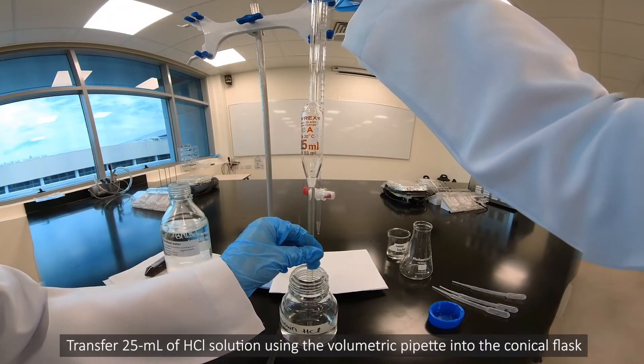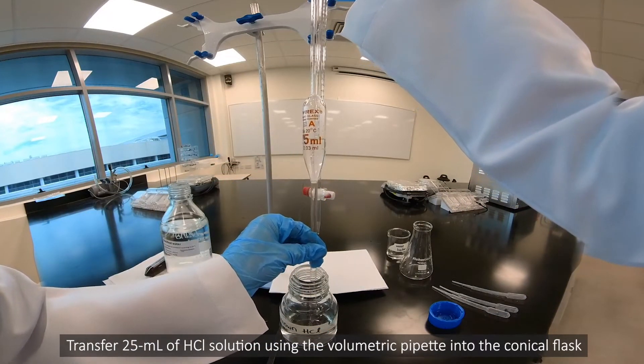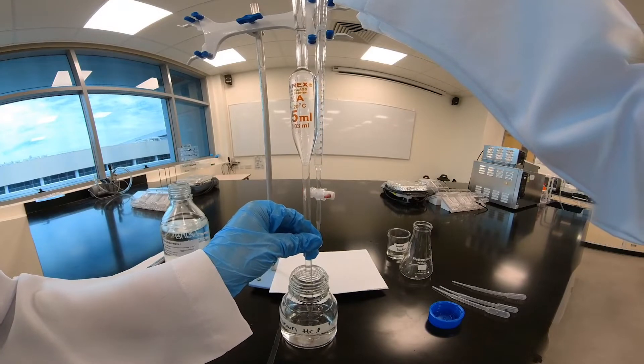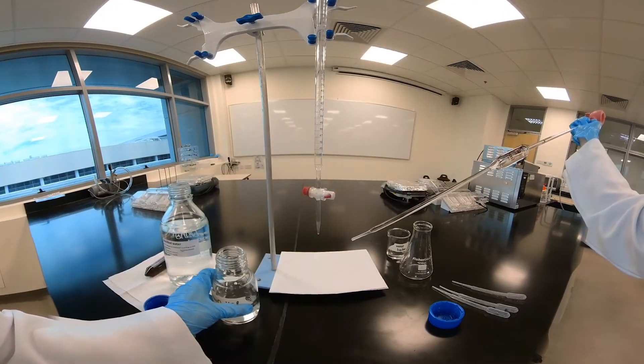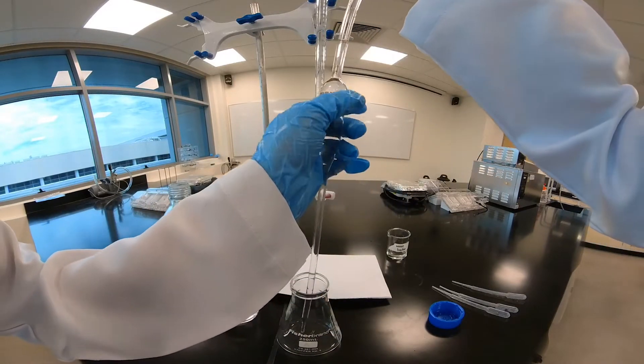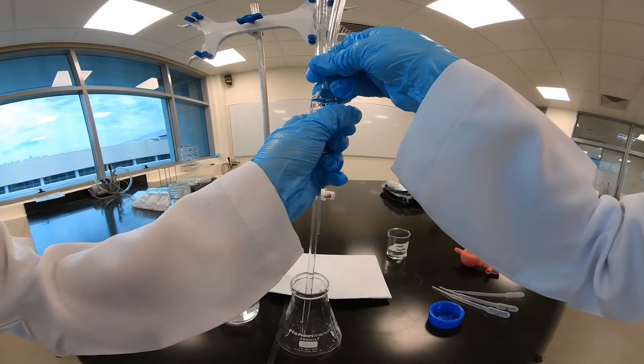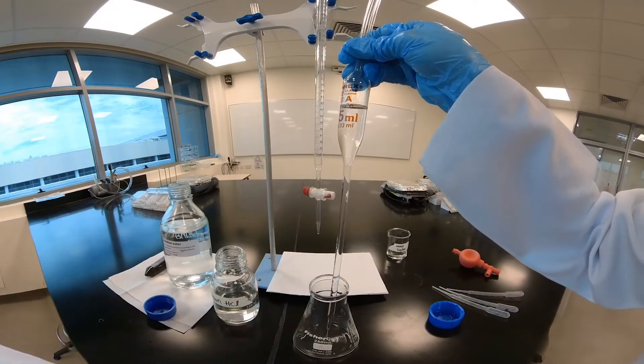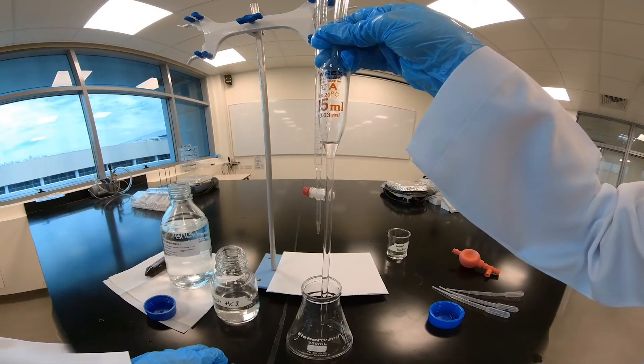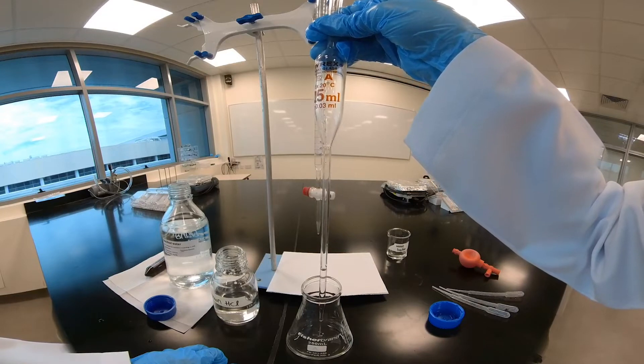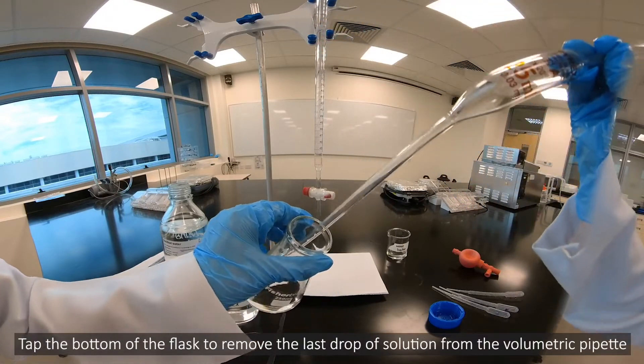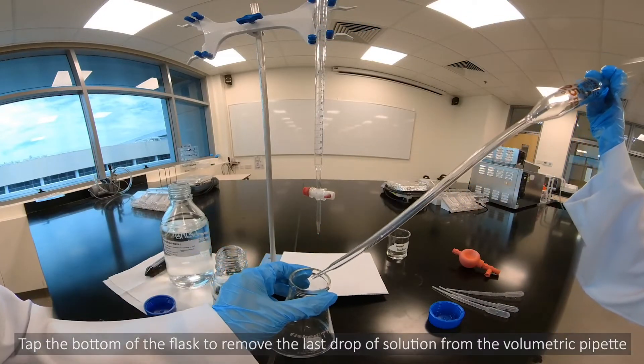Transfer 25 ml of HCL solution using the volumetric pipette into the conical flask. Tap the bottom of the flask to remove the last drop of solution from the volumetric pipette.